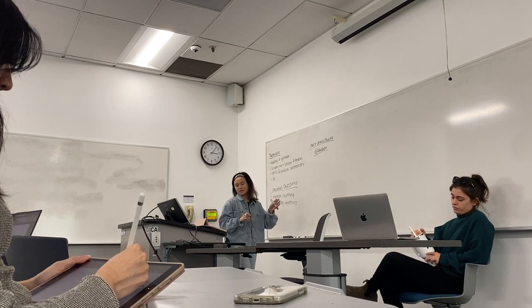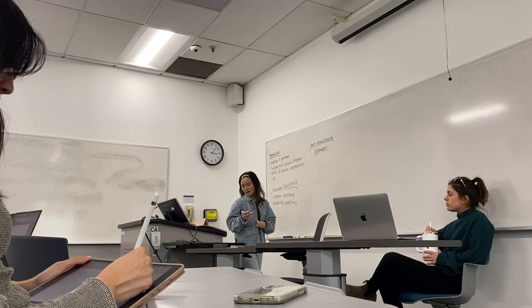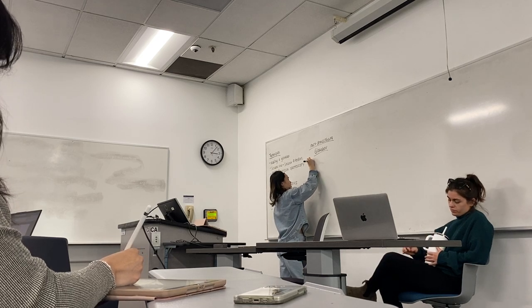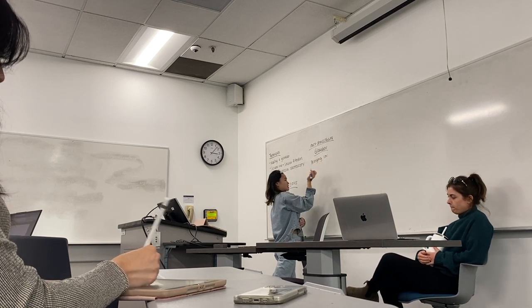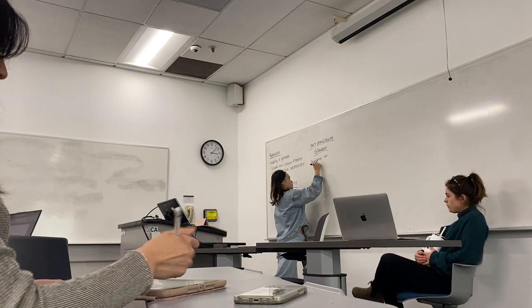So one method we used was a glove box, and one major reason you use the glove box is for dexterity, convenience, etc. When you bring things into the glove box, one of the antechambers is always under evacuation or vacuum. So bringing things into the glove box, it's always under evacuation. So the first thing you need to do is to isolate the antechamber.